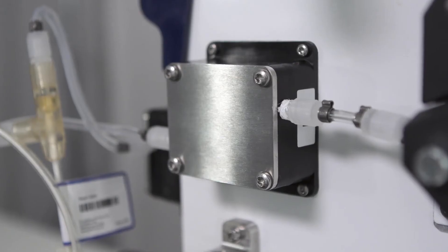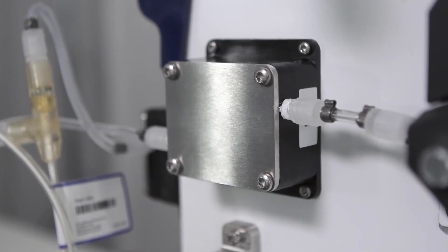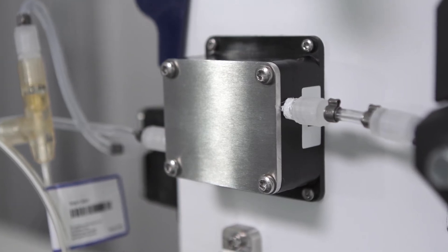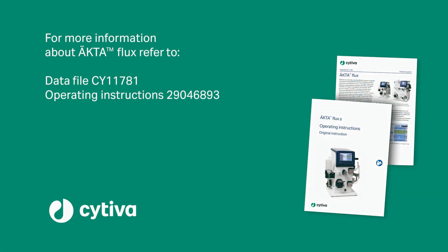In addition to the permeate control pump, a permeate pressure sensor can be installed to monitor the process.